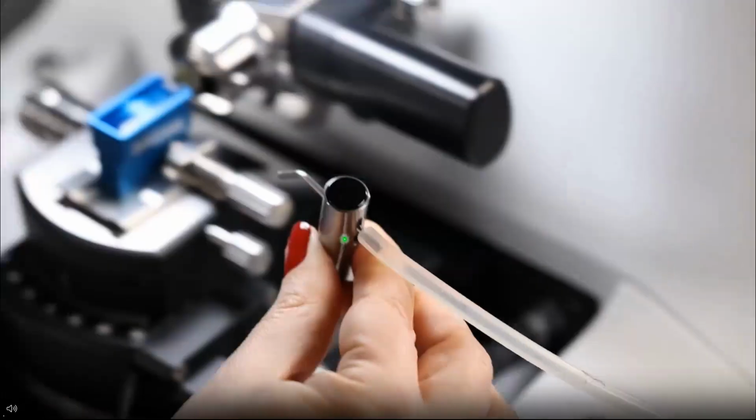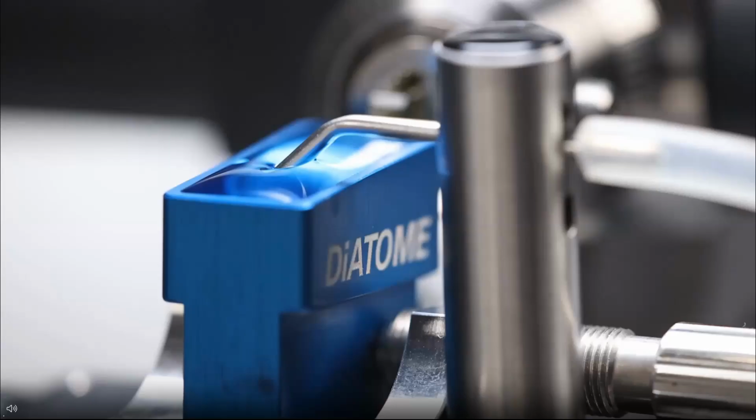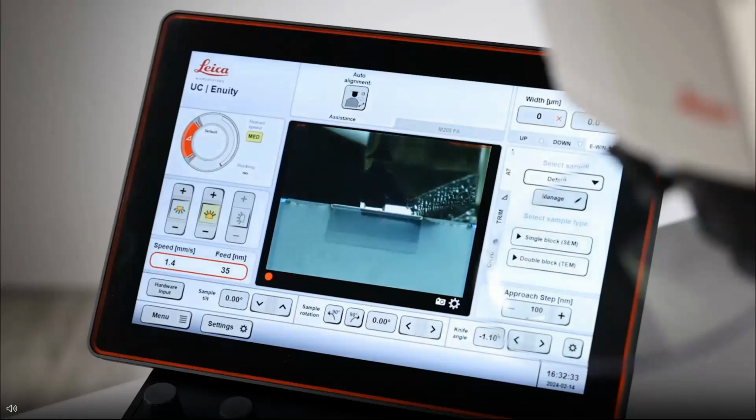Maybe here you can see that the bluish line is appearing, and we are a little bit closer here than on this side, because here it's more bluish than on the other side. Then we fill the boat and can adjust the water level with the reflexomat. And of course, the idea is that we have as few partial sections as possible.